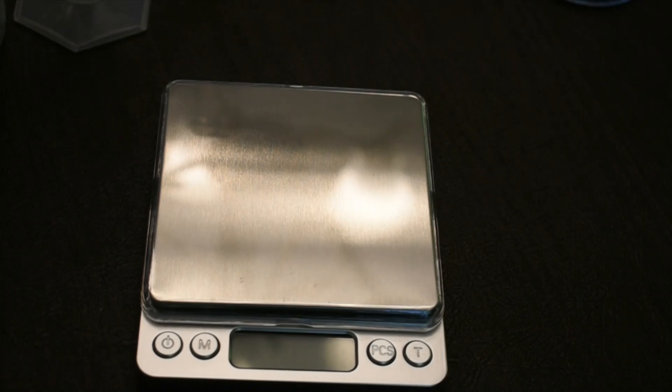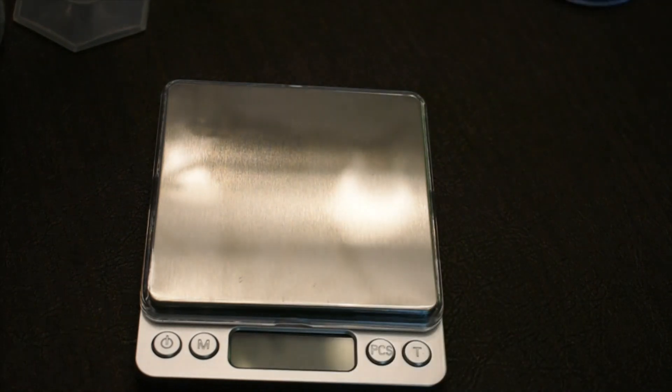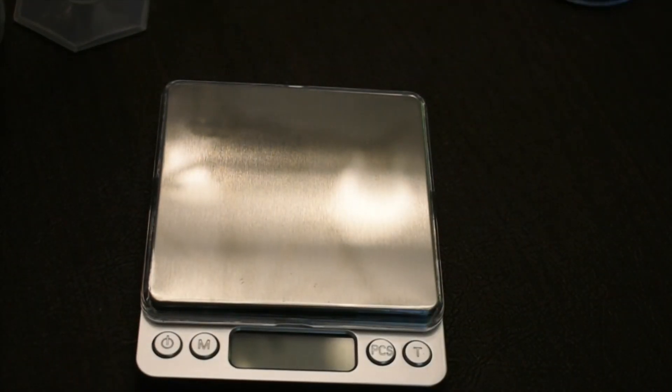The balance comes in a box with batteries included, so it's very portable. You put the batteries in the back, and it comes with a plastic cover to keep things off the pan, and a plastic pan for weighing out solids. When you turn it on for the first time, it says 'hello.' If it doesn't read 0.00, press the tare button to zero it out.